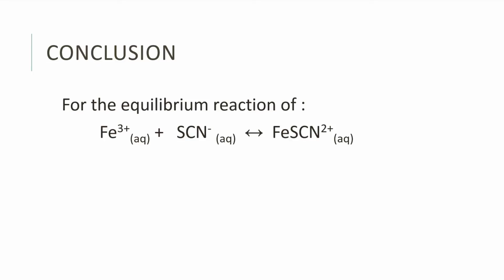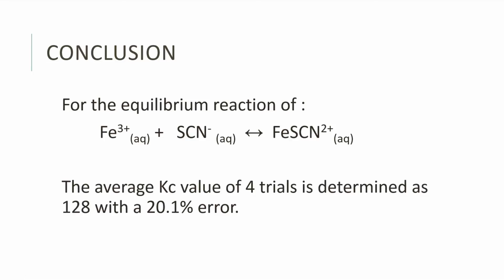Conclusion. The average Kc value of 4 trials is determined as 128 with a 20.1% error.